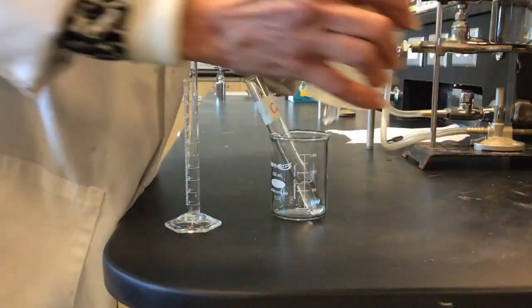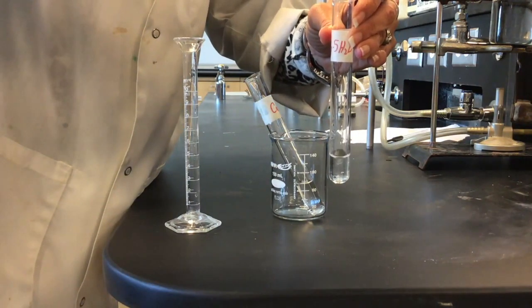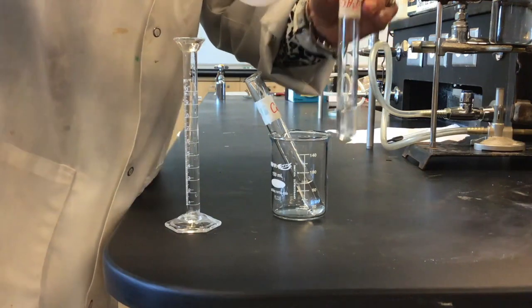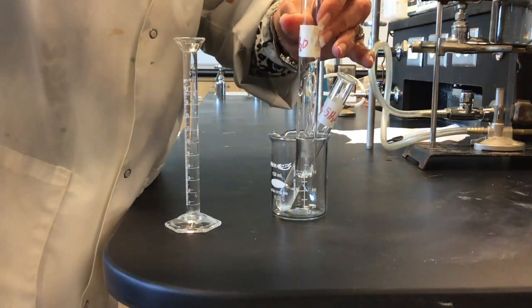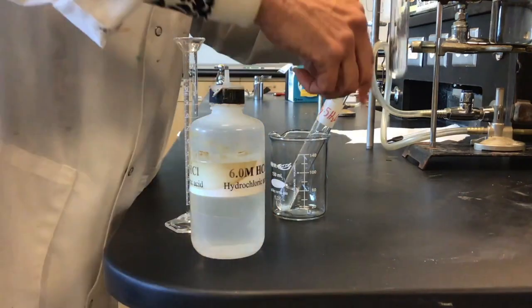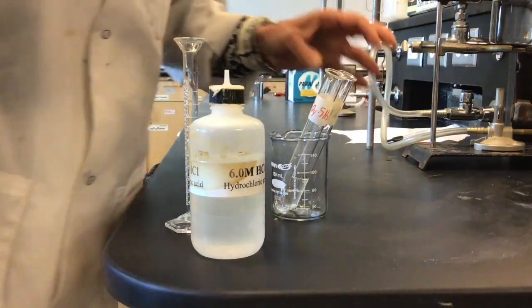And then I'm going to add 10 drops of 6 molar HCl to each of my test tubes. And then go ahead and mix that. And then we'll be adding the copper sulfate next.